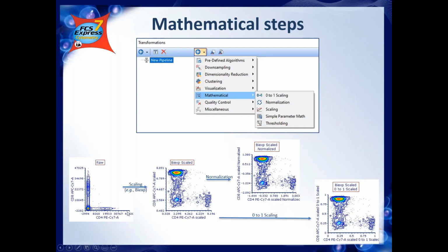This is not what we are happy to do. So this is why we always apply a scale. Now, we are doing this in plots and in histograms to make the positive and the negative population more comparable. Technically, to stabilize the variance, so to make the variance more comparable between the two populations, or anyway along the range, let's say.